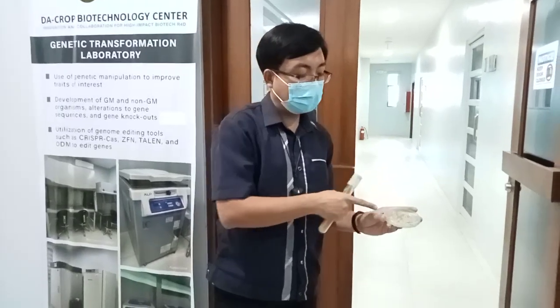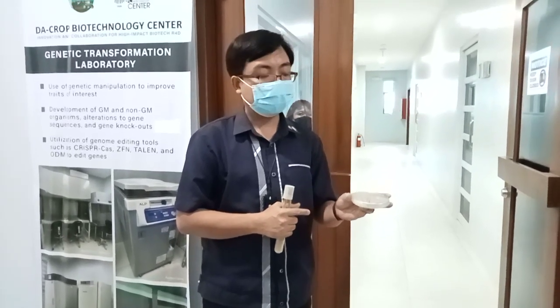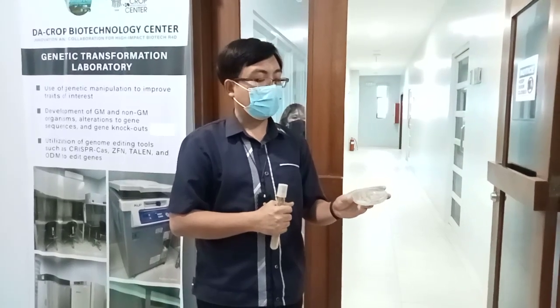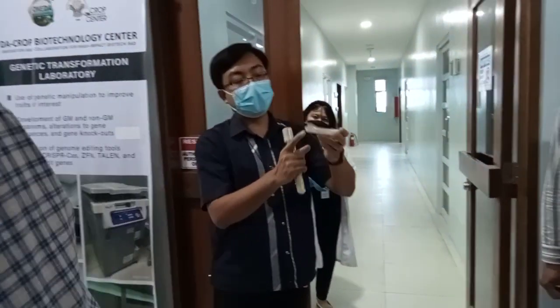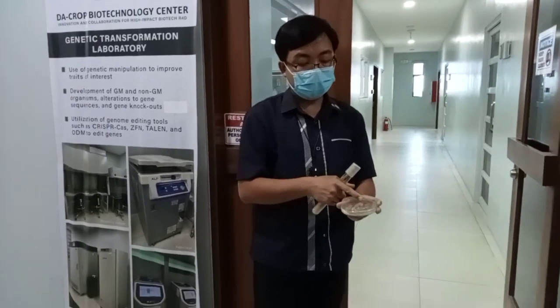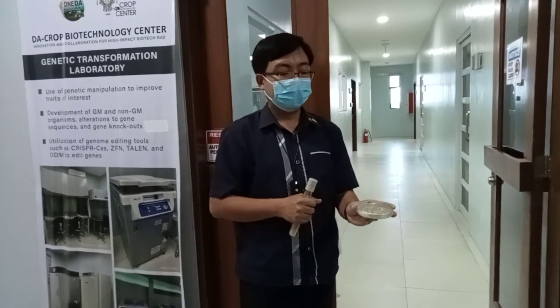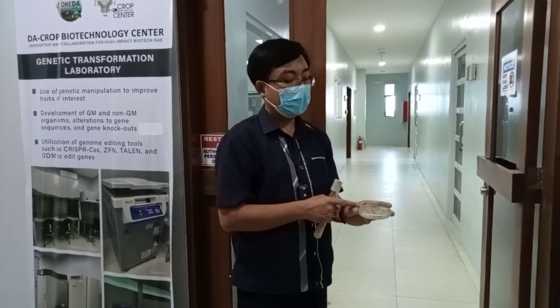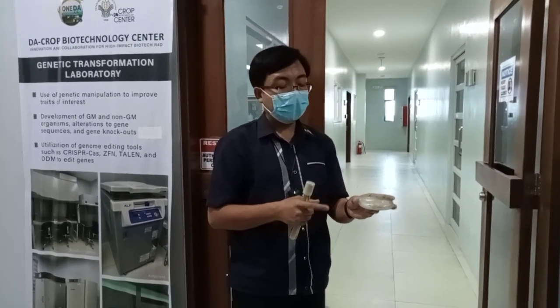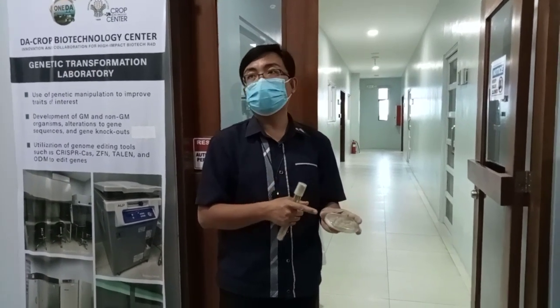So first we have to have rice callus. This is from the grains of rice. The grains will be grown on callus induction medium, and then they will differentiate or undifferentiate into these callus. And then this will be infected by Agrobacterium tumefaciens. And that will become transformed, and this will be able to grow on hygromycin medium.